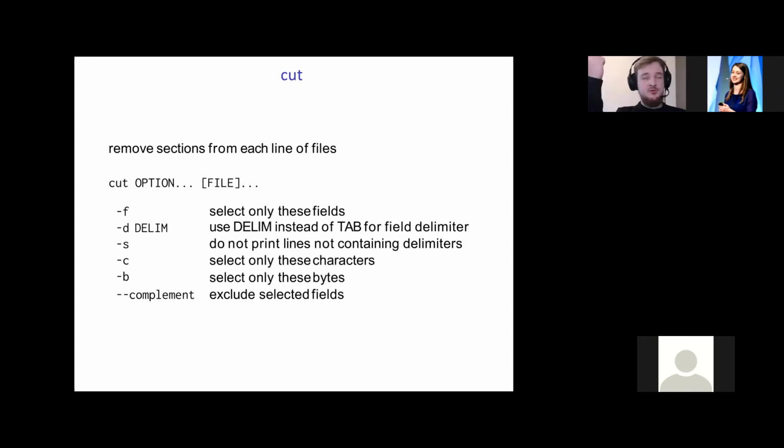Often not all file formats are consistent in their delimiters. We could have the first 5 columns separated by tab, and then a last column which includes a lot of information, where the information for each field is separated by a pipe, for example. That is the case in the VCF file that we will look at later.